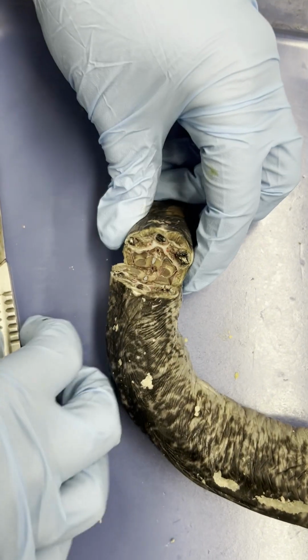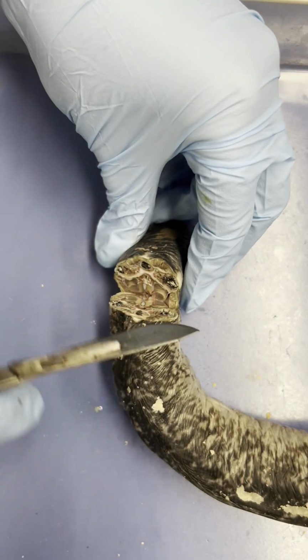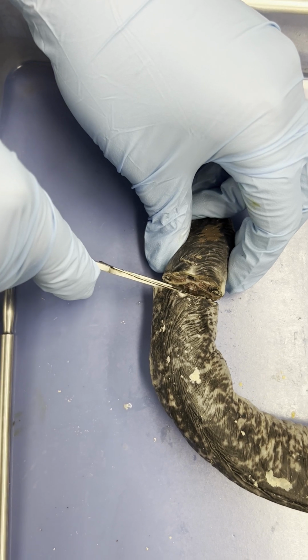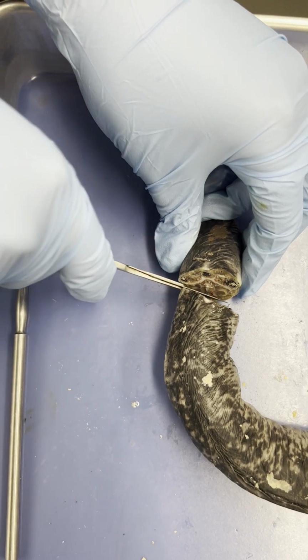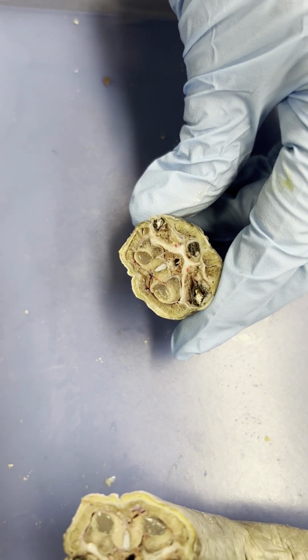But we have those. If you have any remaining tissue along the bottom, that's no problem. You can just cut that thin layer of attachment there. So just be gentle. And now we'll work on our second cross-section site.